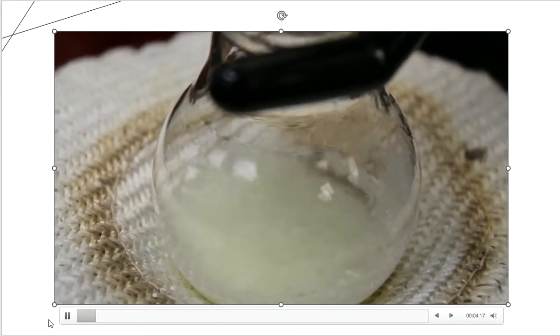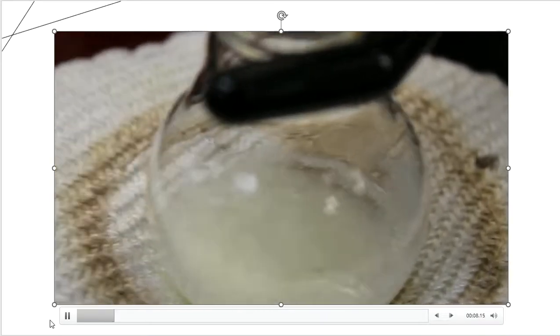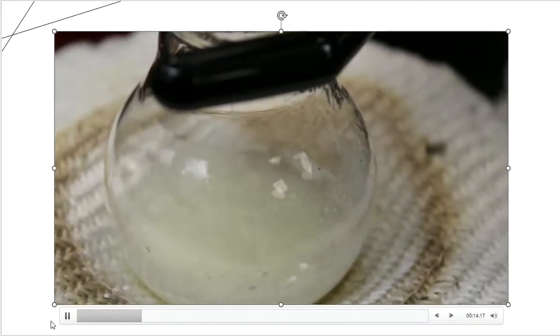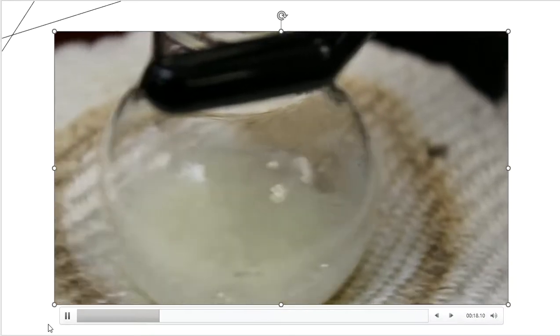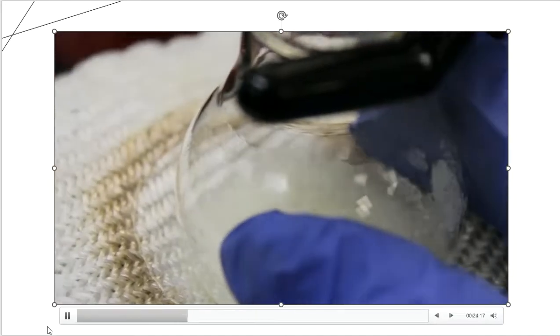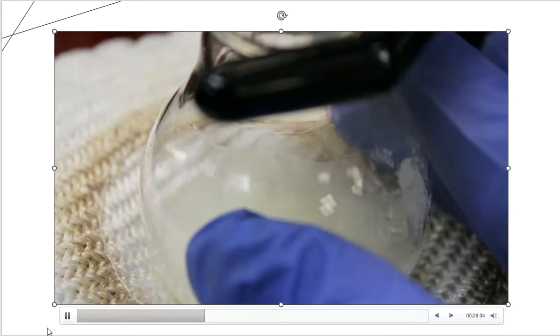All right, there's my aluminum chloride solution that's beginning to bubble. So we're going to let this thing kind of do what it needs to do, and in 30 minutes we'll come back and take a look. It does say to gently boil. I'm really uncomfortable with the amount of boiling that's happening here. If I feel the flask, it's actually very, very cool. It's not hot at all.